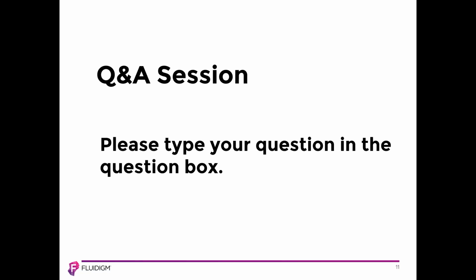Great. Okay, one more question for you, Lindsay. For an IMC experiment, how many ROIs do you recommend per sample to capture the heterogeneity of the tissue?